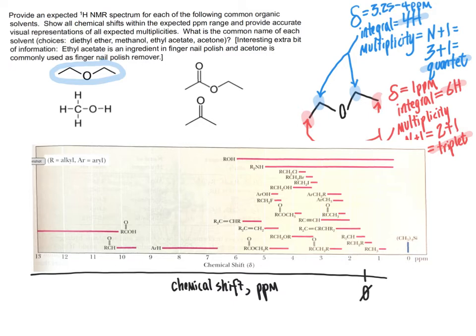And so now what we can do is go ahead and plug in this information that we have sketched out here in words into our spectrum.